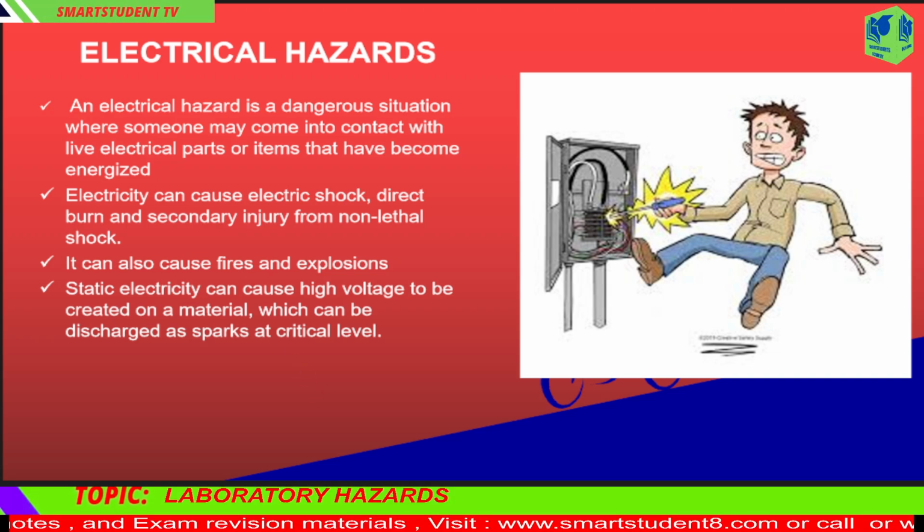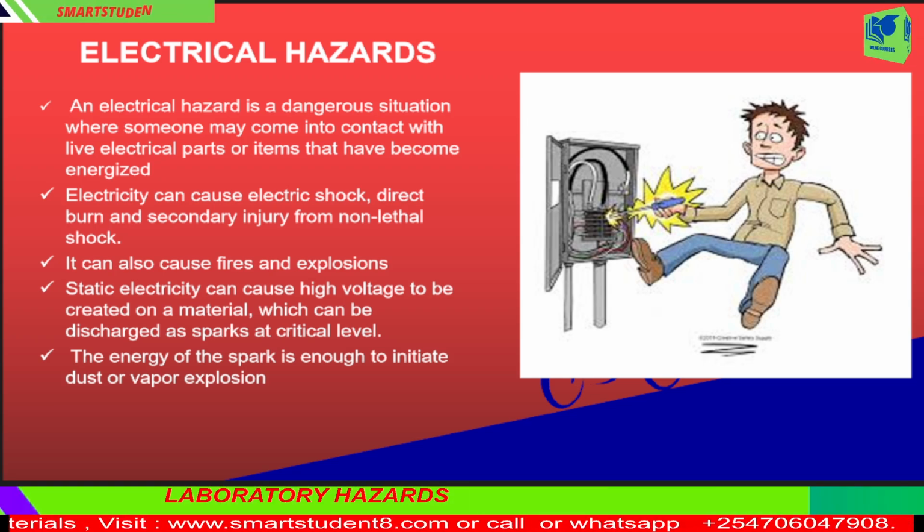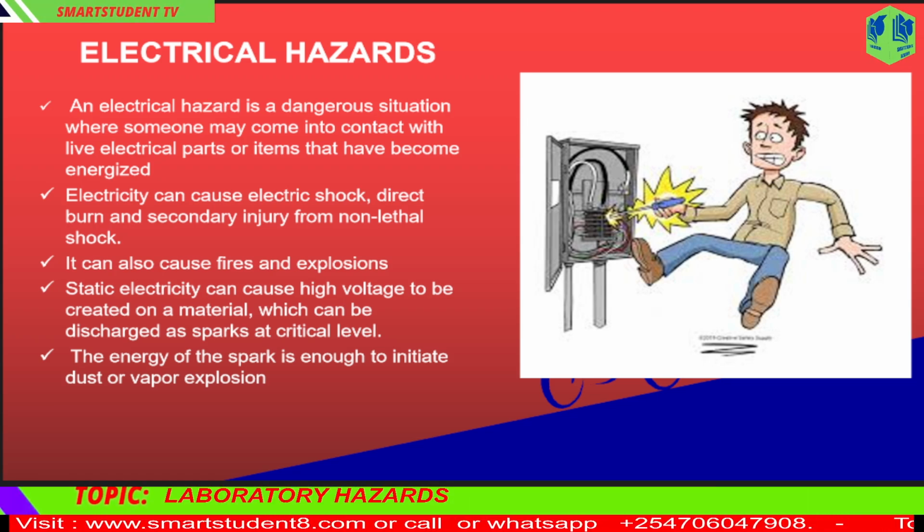Static electricity can cause high voltage to be created on a material, which can be discharged as sparks at critical level. The energy of the spark is enough to initiate dust or vapor explosion. Electrical hazards can be prevented in various ways.